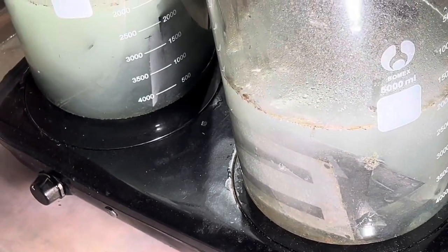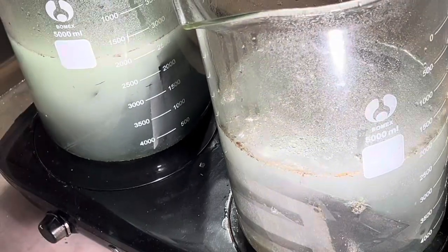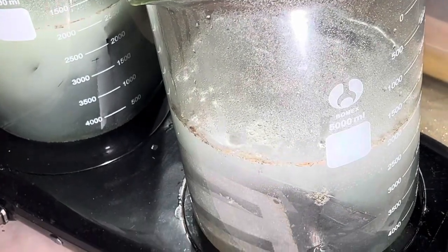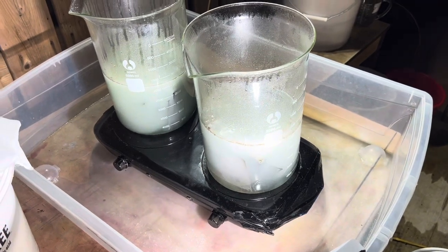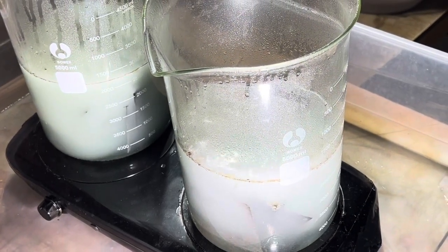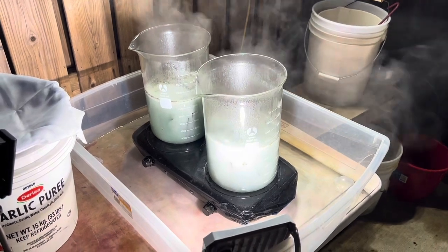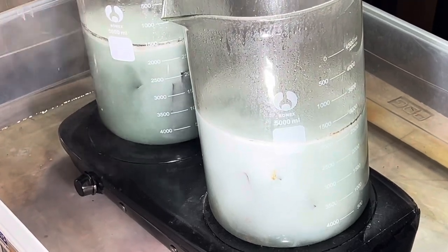It looks like it's going faster now, so I'm going to keep it going until the reaction stops. When the reaction stops I'll filter this, and tomorrow hopefully I'll get some iron sulfate crystals. With a little heat, a little more water and more acid, it's going nice and strong.